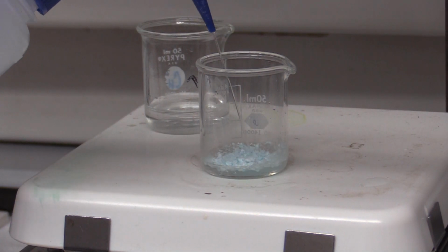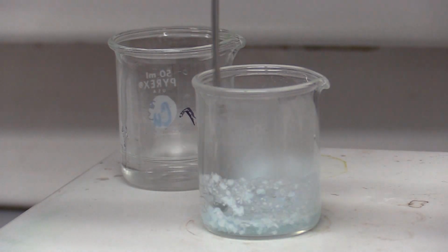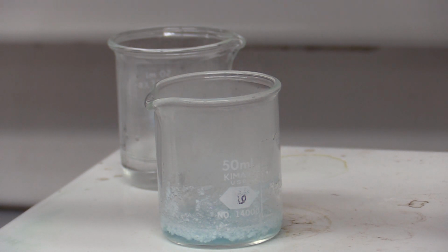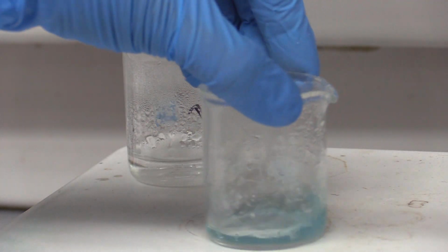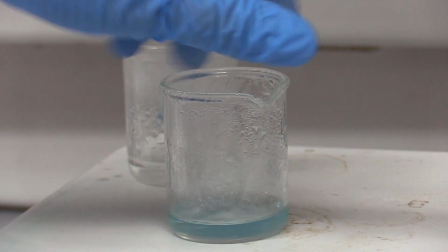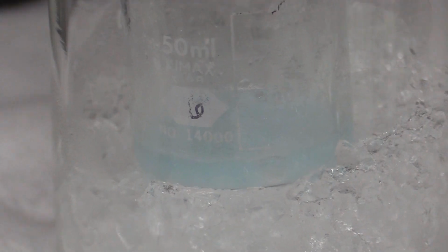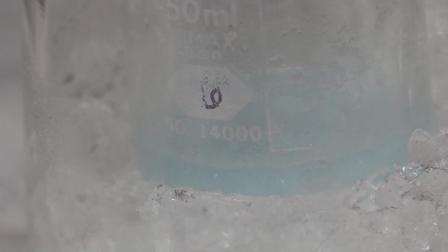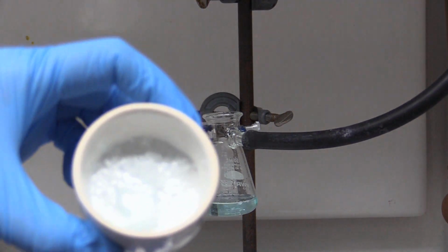Add a very small amount of water and have some water heating in a separate beaker in case you need to add more. Heat the mixture of water and crystals and add hot water as needed to dissolve the crystals. Remember to add a minimal amount of water. Once it is dissolved, cool to room temperature, then cool it on ice and filter again. Don't forget to get a mass and a melting point to confirm the product's identity.